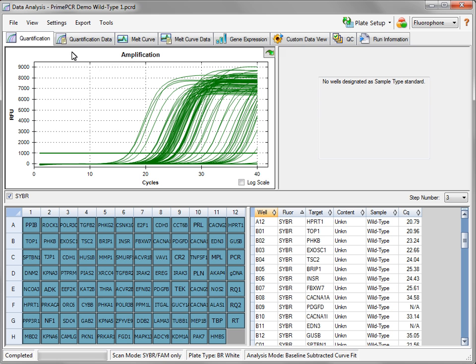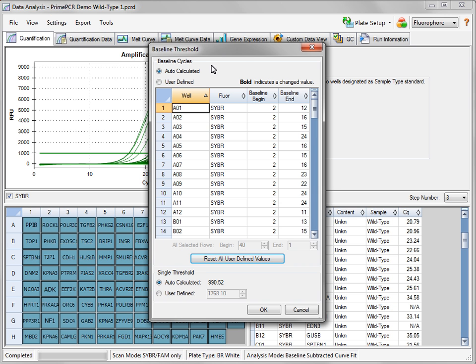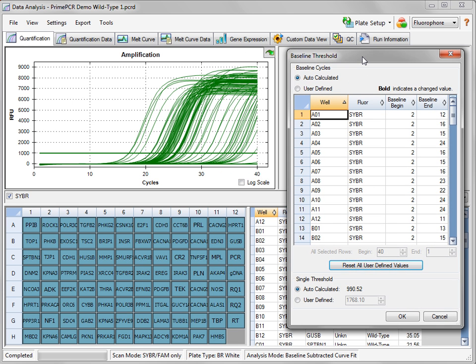From the Settings menu, select Baseline Threshold. The cycles used to establish a baseline for your traces is automatically calculated by default. If there are traces for which the baseline is not flat, change the cycles used for this determination by clicking User Defined and manually entering the values for specific wells.